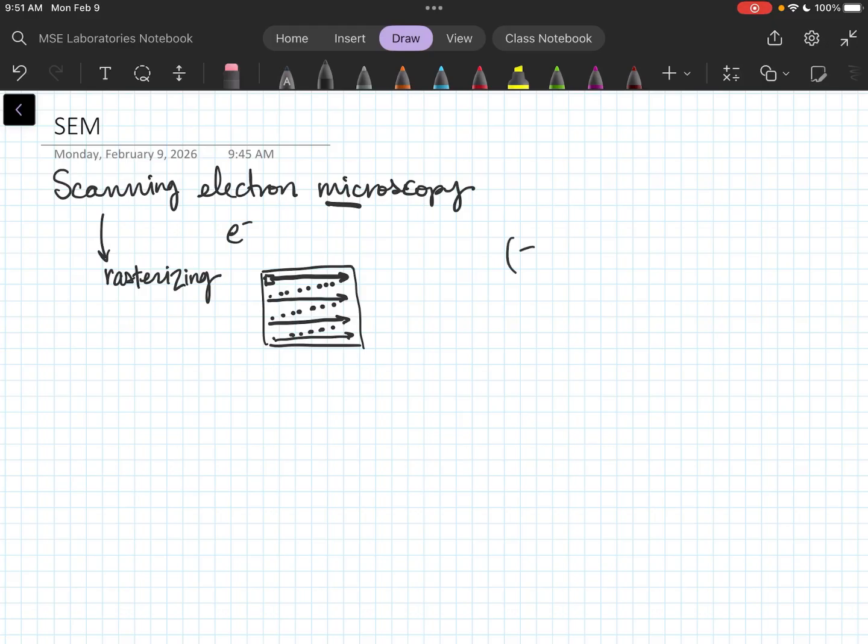There's another kind of electron microscope. You can also use something called a transmission electron microscope. It has the same E and M, so I'm not going to write those out. But a transmission electron microscope, or TEM, I'll put a little label, so that's clear.